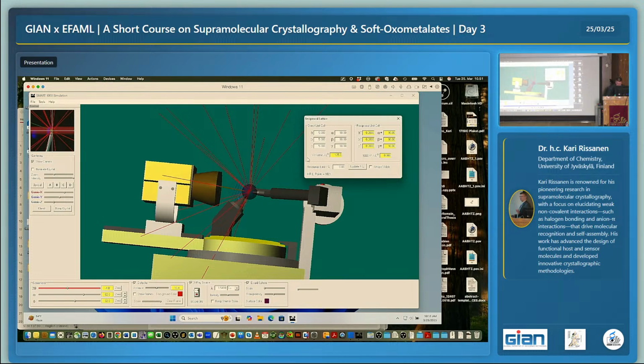I will just change one axis to 10. Now it will increase the volume. And at the same time, because the resolution is constant and it's a bigger unit cell, it can calculate more of these lines or the planes. So it means that we will have more of these points. Let's see what happens when we do this. So now remember 1000. So I will do update. 2000. So this is logical because it doubled. One of the axes was doubled. So now there are 2000 individual things.